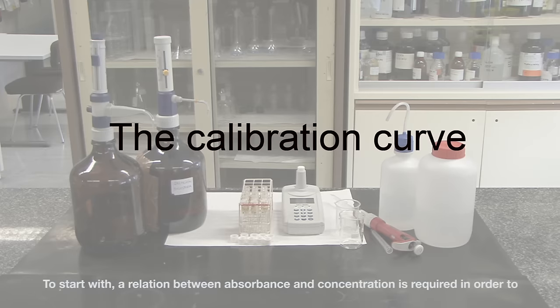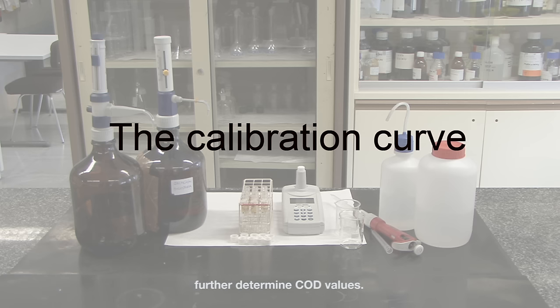To start with, a relation between absorbance and concentration is required in order to further determine COD values. That is the reason why a calibration curve is prepared.